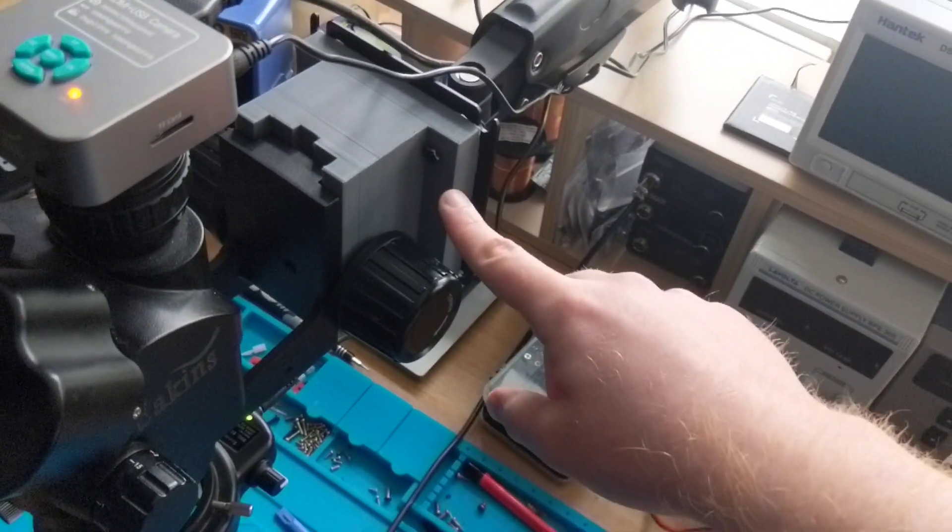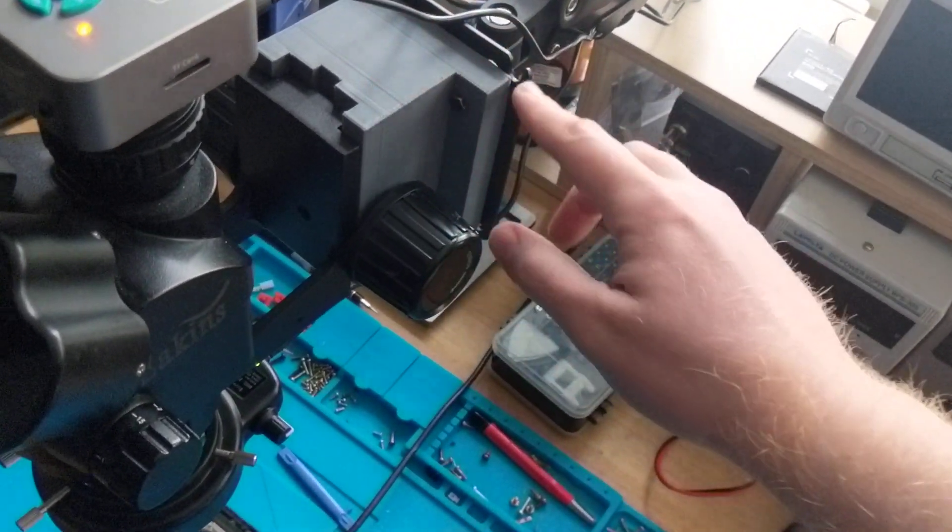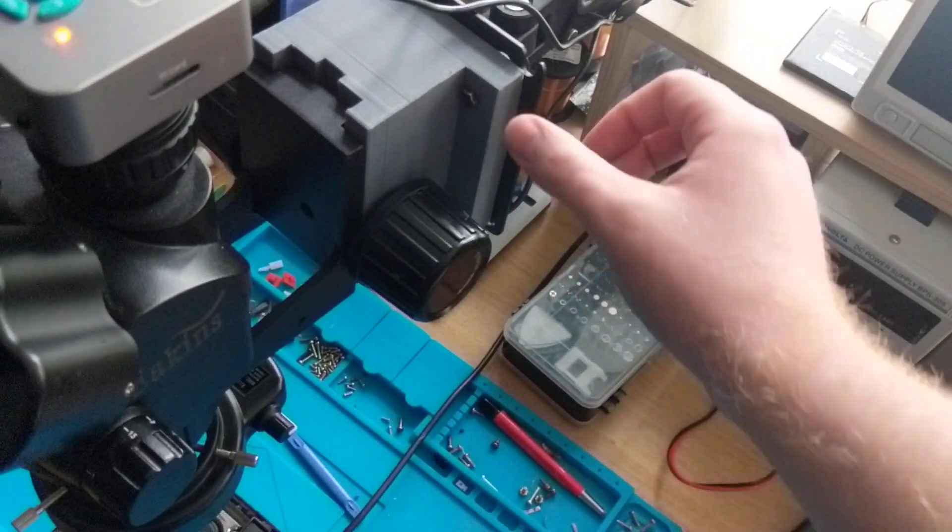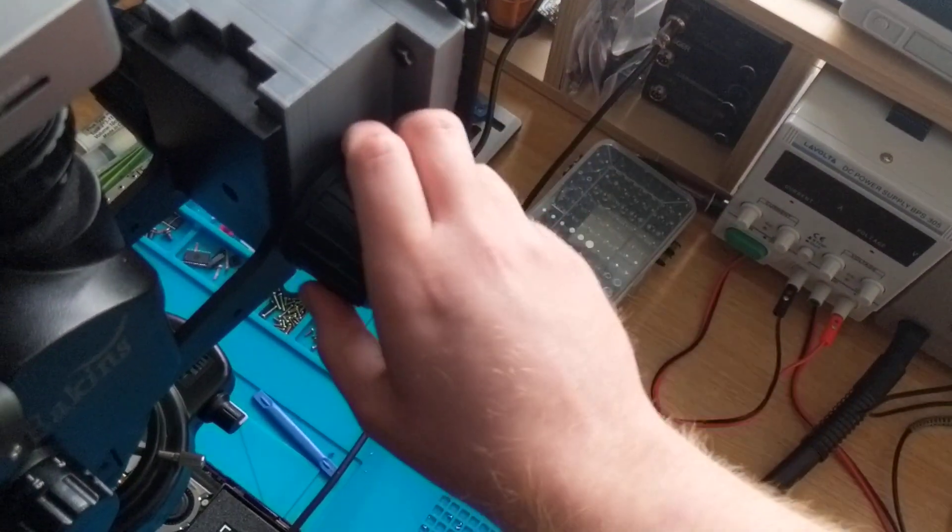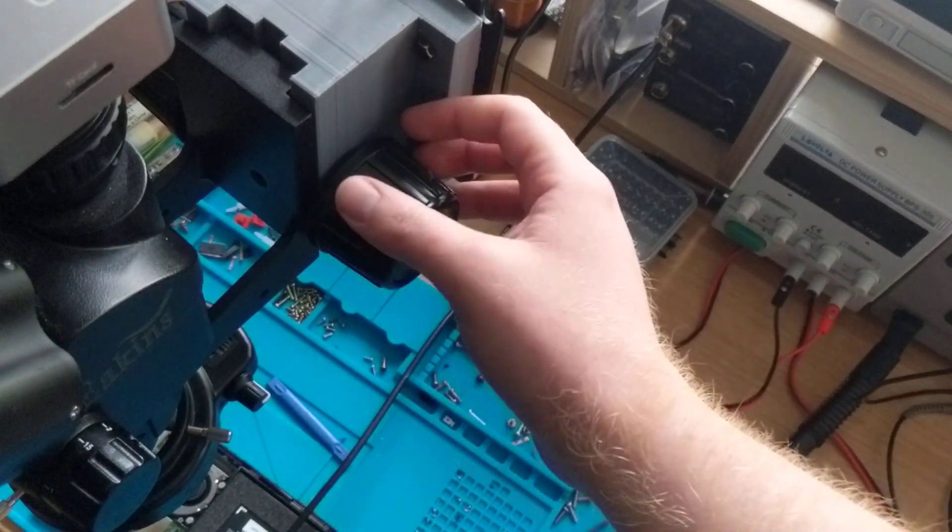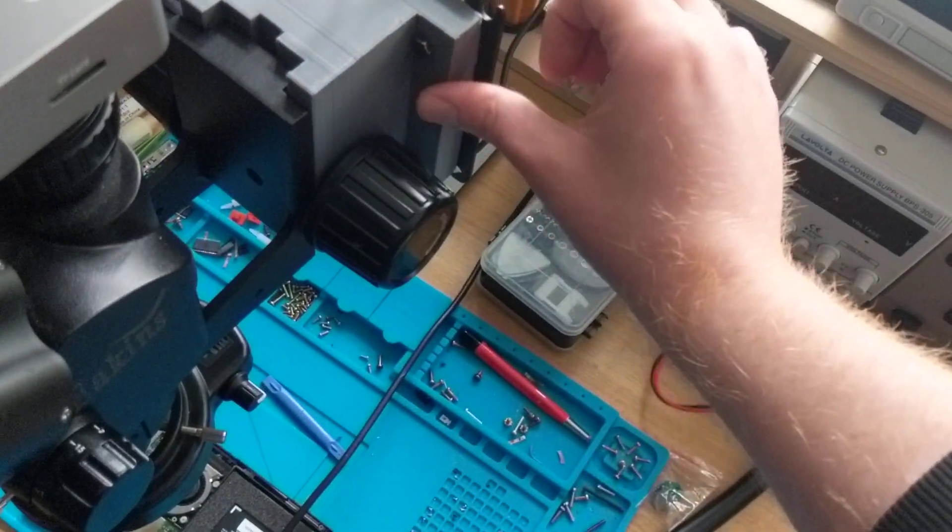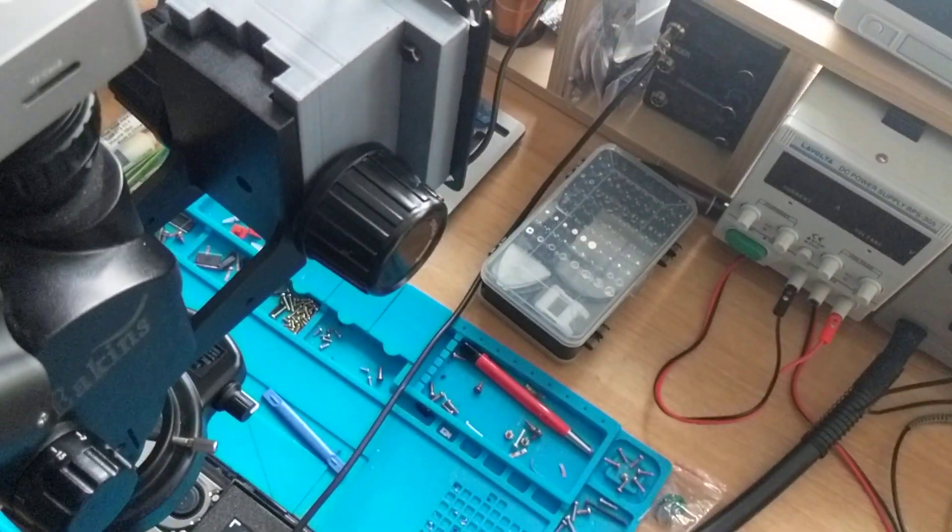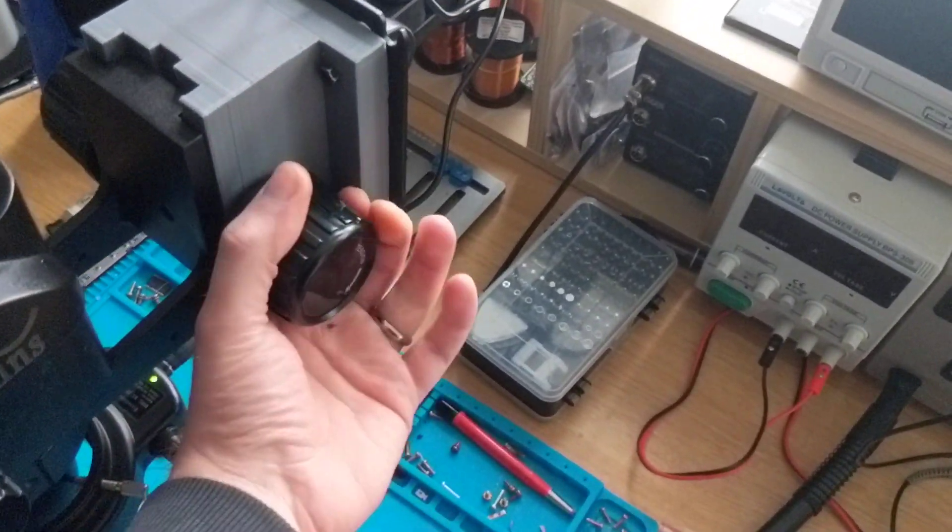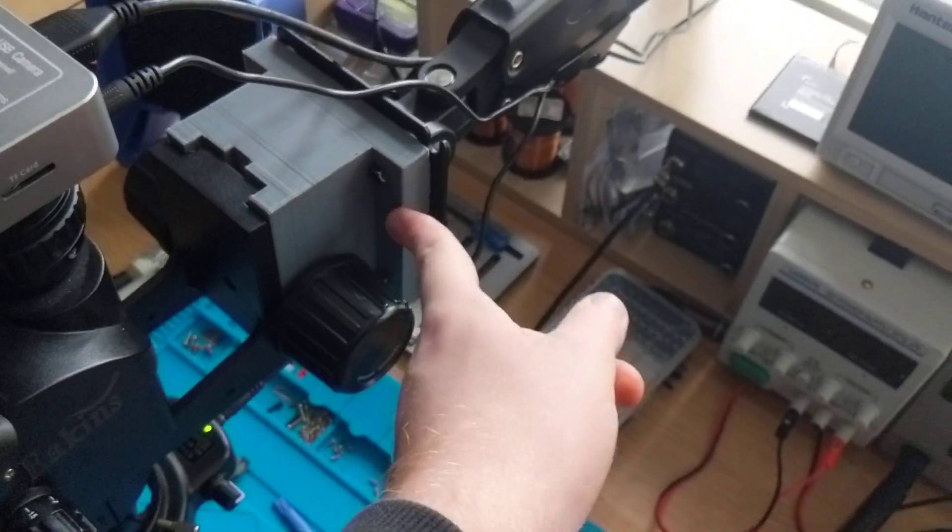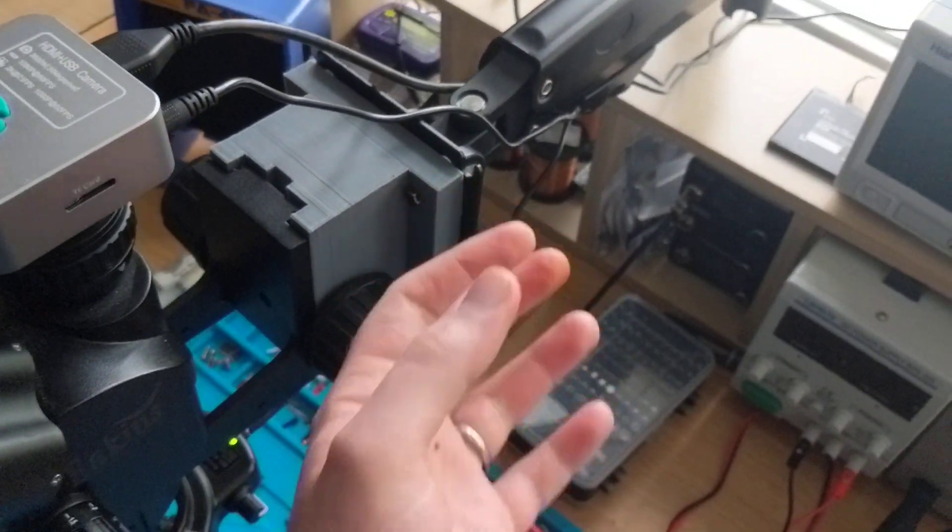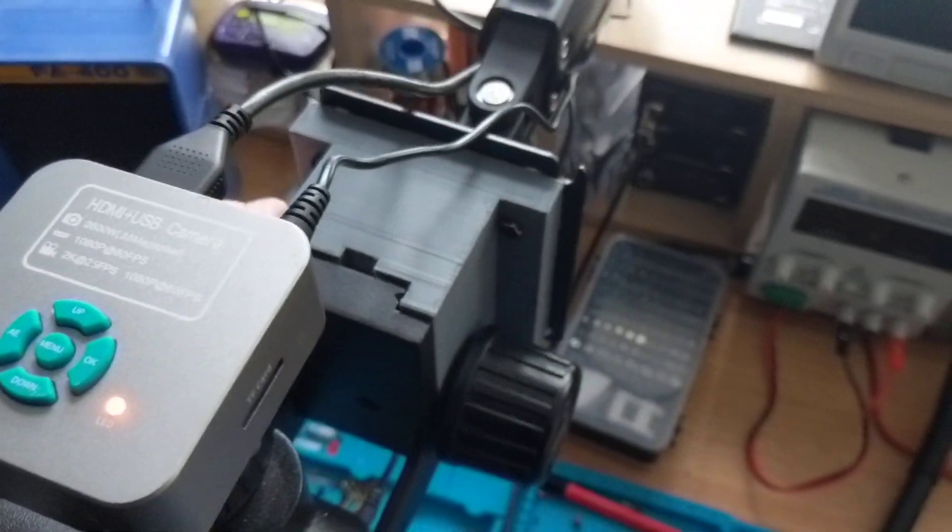I recommend printing the V1 version of this. This is a pre-V1 version so the edges are quite sharp and as you twist that you may find you cut yourself on the sharp edge. With the V1 version the edges are filleted and rounded so you're not gonna hurt yourself with it.